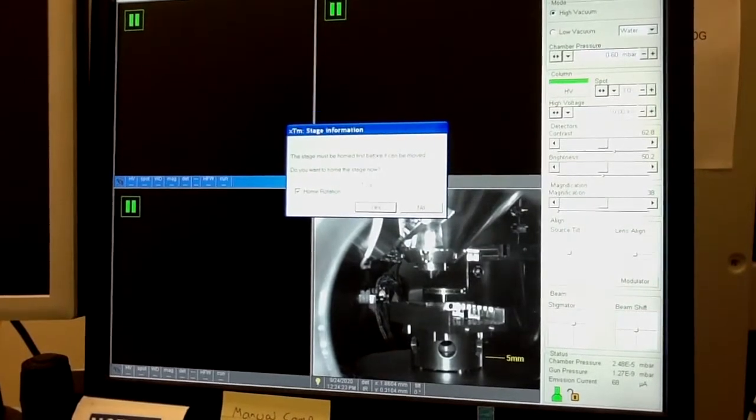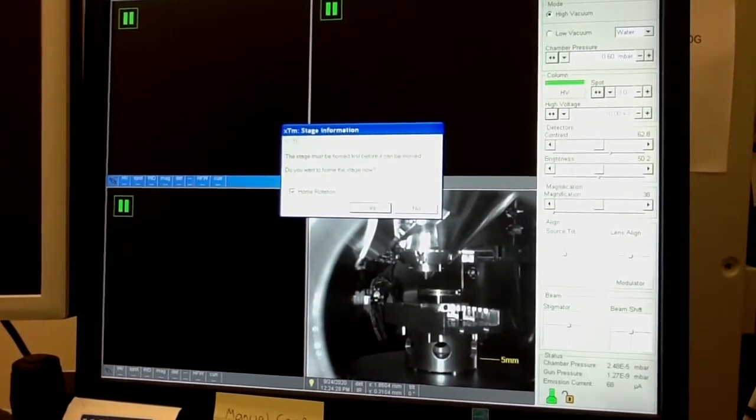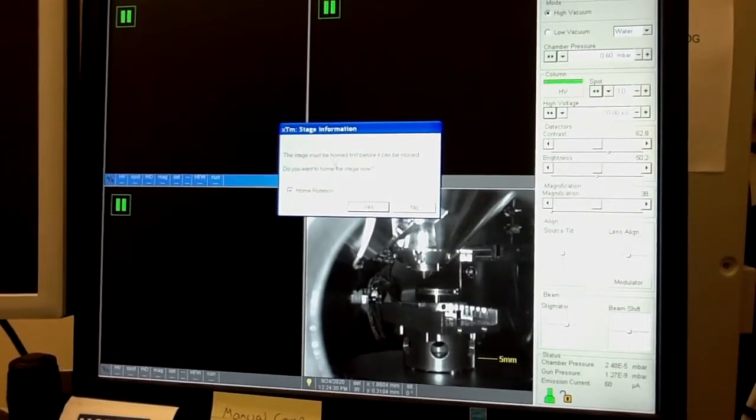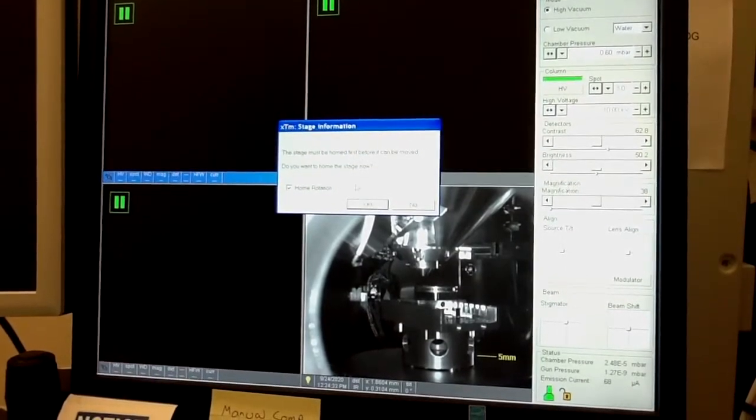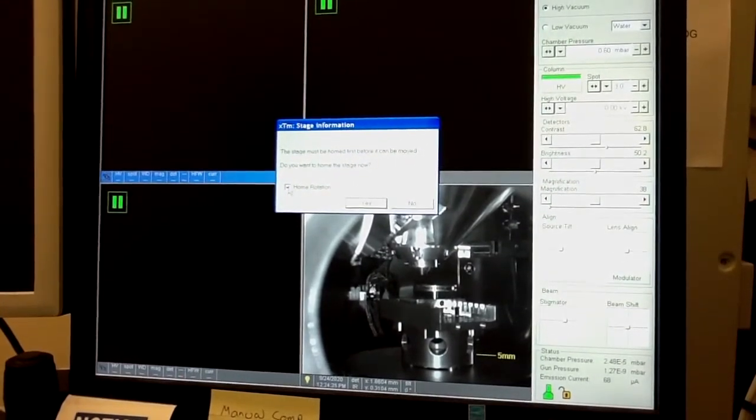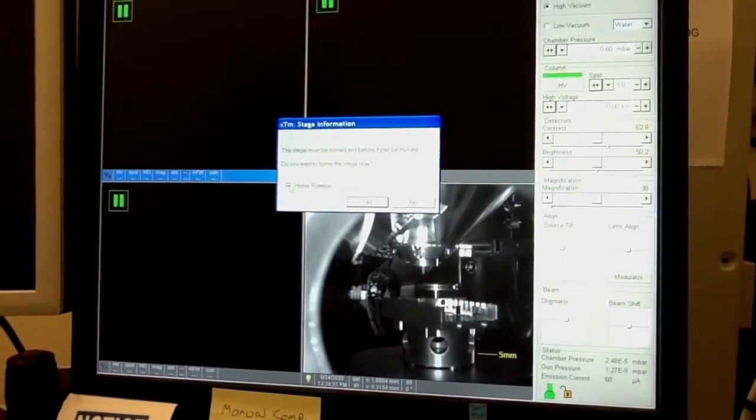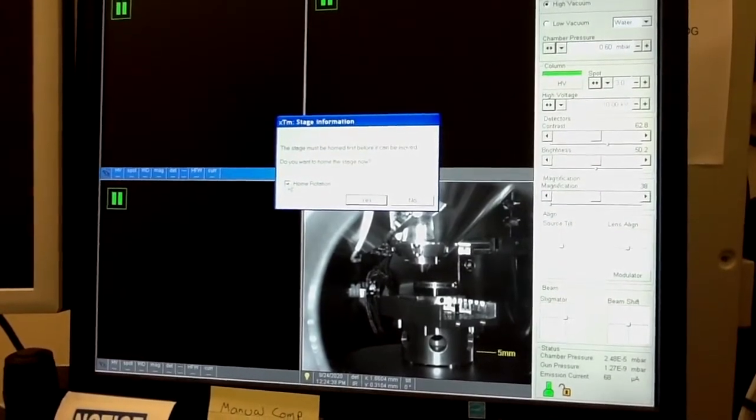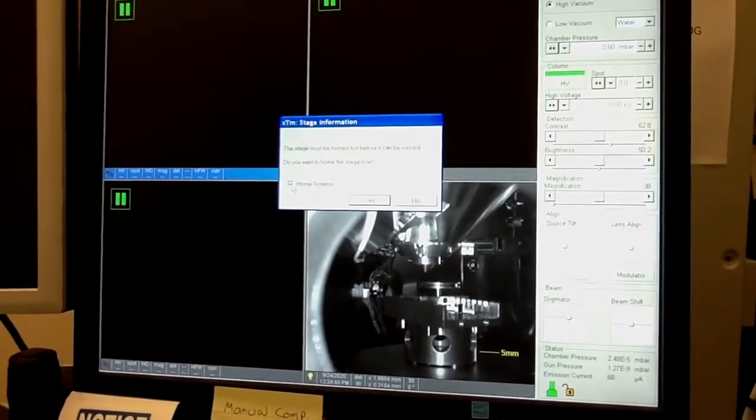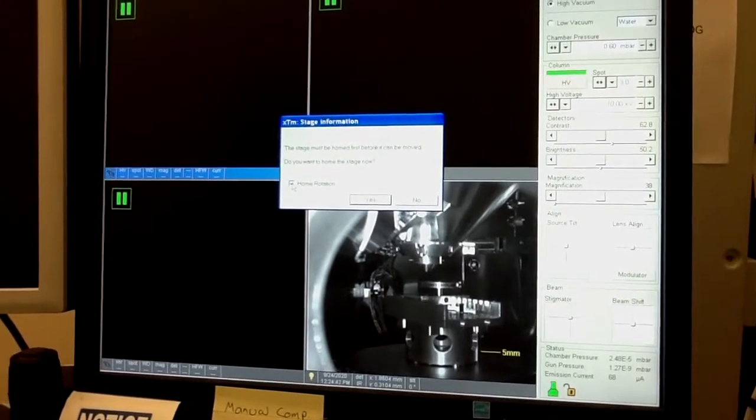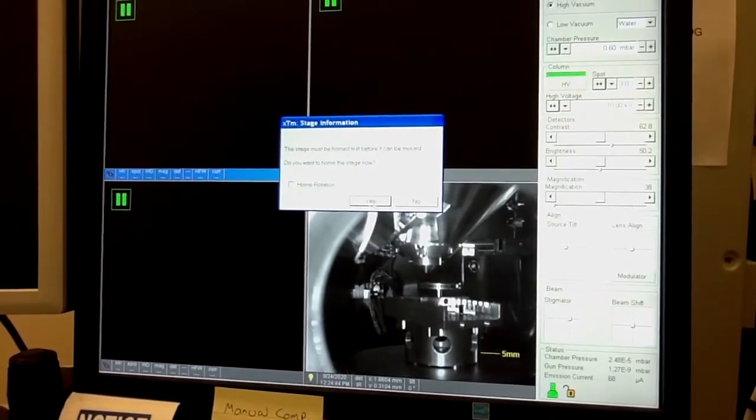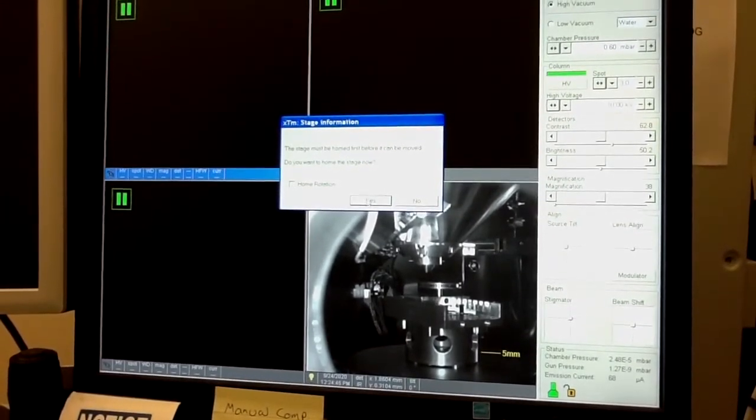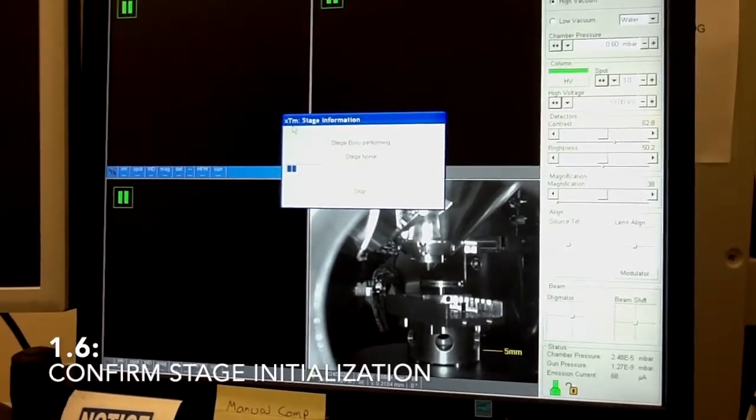The first thing which you will be asked is whether you want to initialize the stage. And typically you should do it. If you will need rotation of the sample, you should do it with rotation. If you don't, and I really don't need to do it, so I will do it now without rotation. So just uncheck this box and confirm this process.